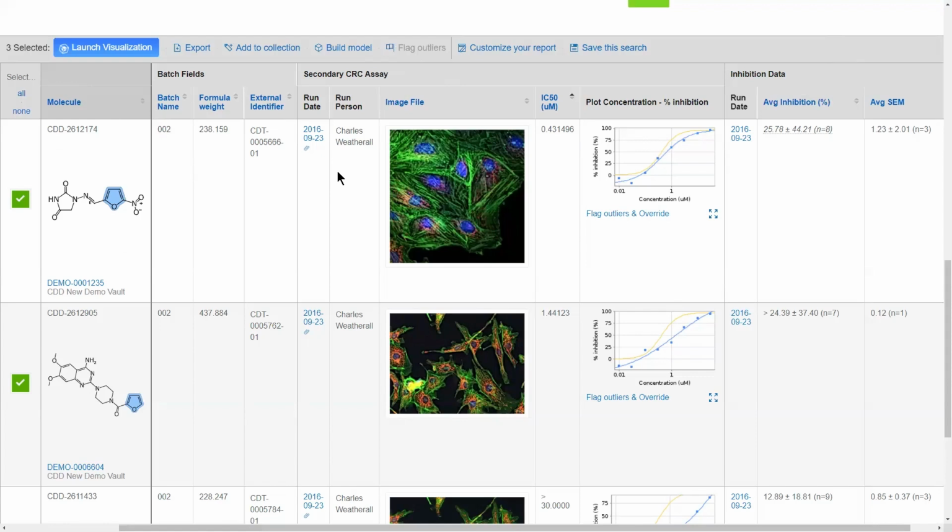The idea behind activity is that when you have a category of assay to run, so if you're running a specific secondary CRC assay or an inhibition data assay or ADME, PK, tox, really any type of assay, an end user would come into the system, create the assay and its framework, and then subsequent data loads would utilize a preset framework. So you create the assay once, and then every time new data is generated for that particular assay, you would upload what we call a run or a new experiment to that assay.